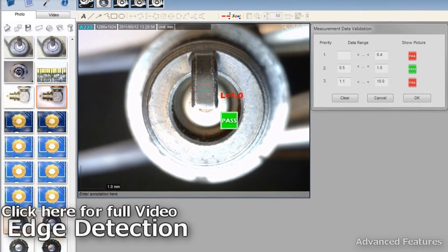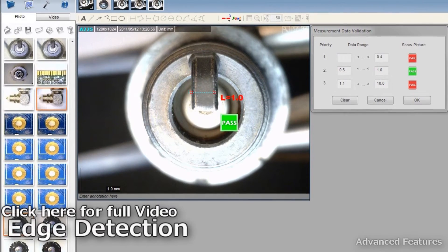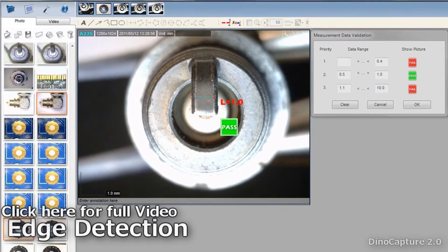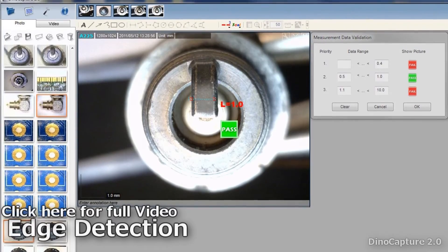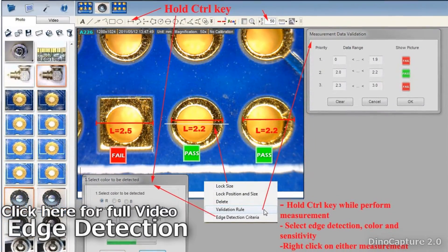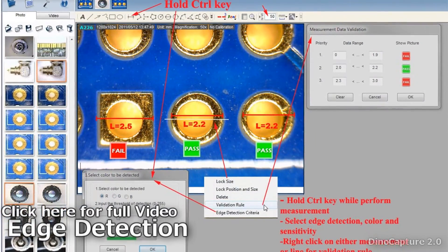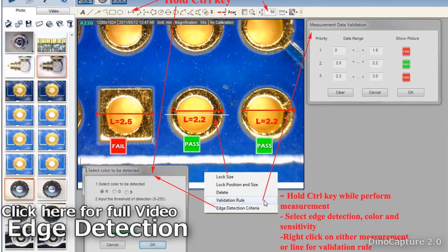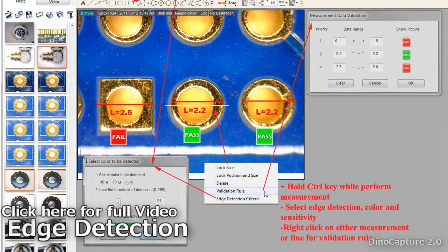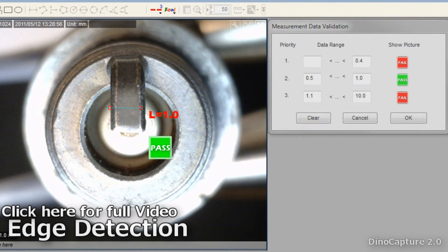Edge detection is an auto distance measurement feature that helps automatically detect edges based on contrast for quick and accurate validation. Click on the link to view the full video on how to perform edge detection with Dino-Lite and DinoCapture 2.0.